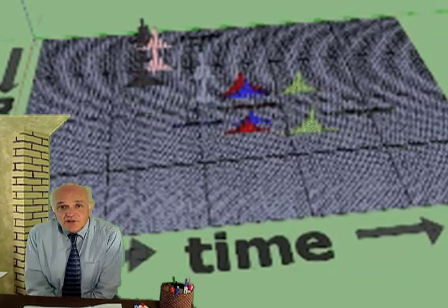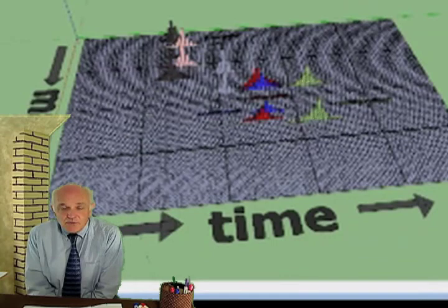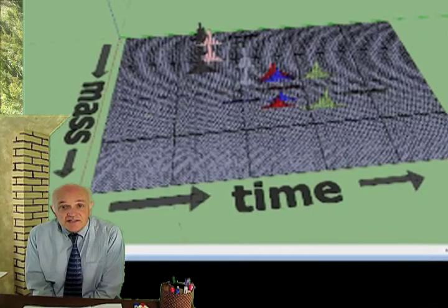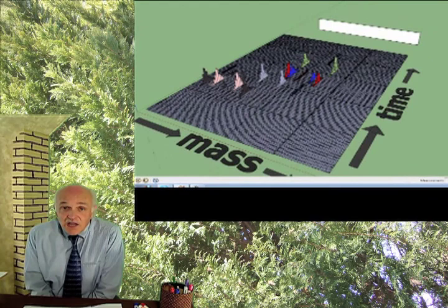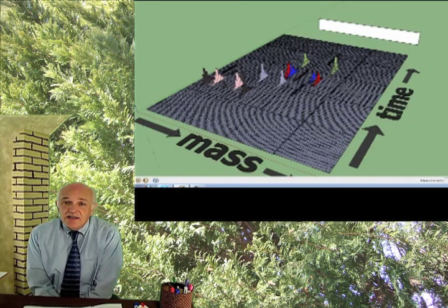So you say, well, that's not right. You turn the little dial till it says 190. You get off the scale, you get back on, it says 190. You know you do, in fact, weigh 190. So you assume that all the other weights line up appropriately. I think the mass spec works the same way.